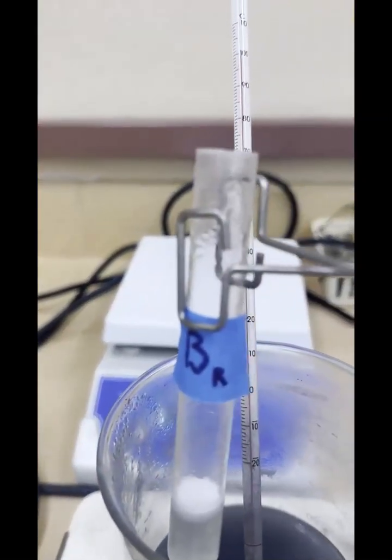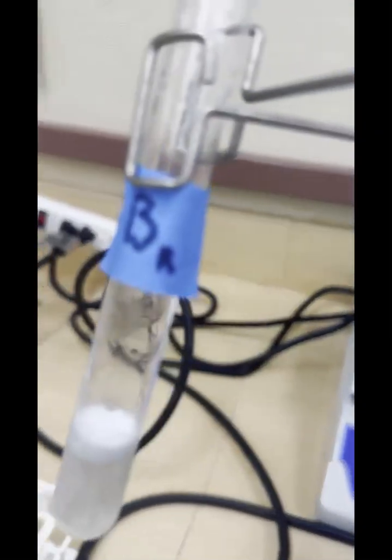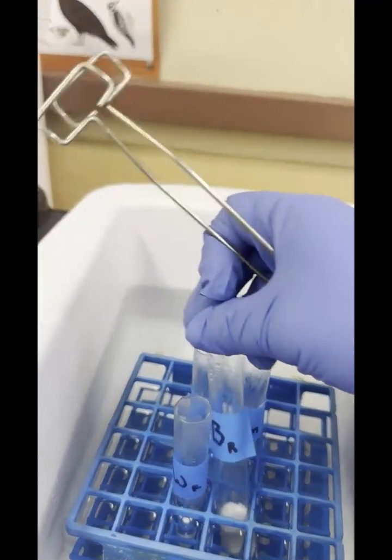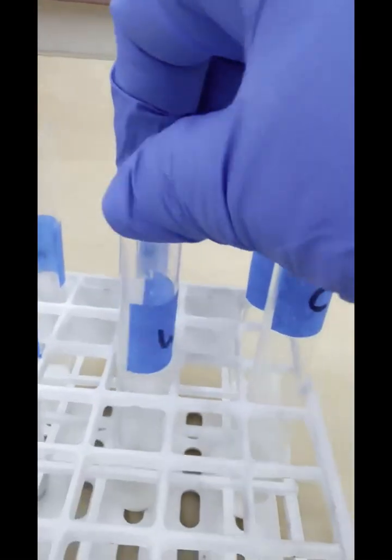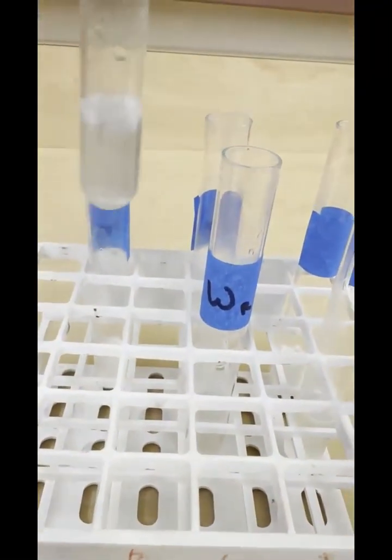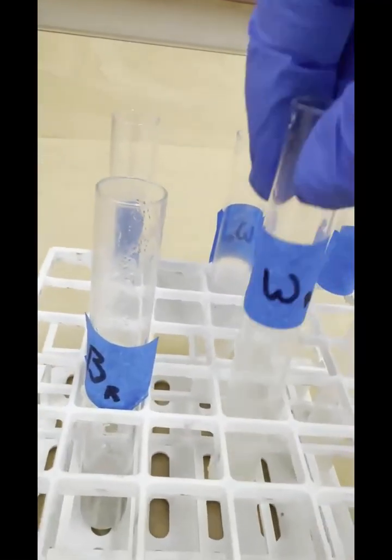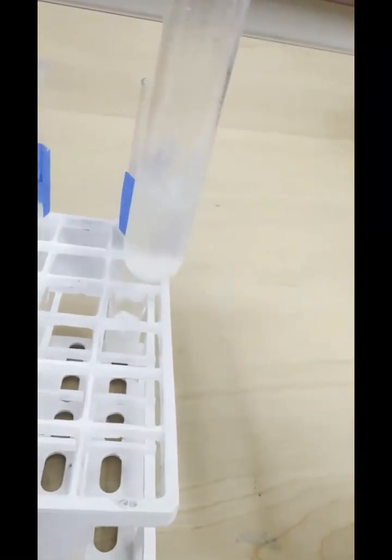Okay, boiling rennin right here, and I'm going to place it into the water bath. So boiling into the water bath. And I expect that in these 3 conditions, the boiled rennet should be denatured and no longer active, the warm rennet is probably pretty happy, and the cold rennet is probably still active but not moving much.